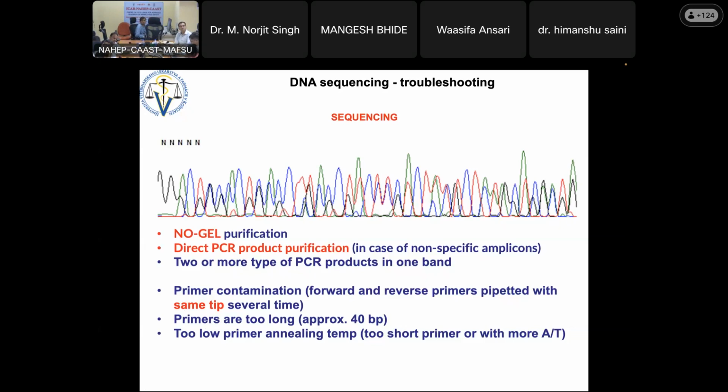Yeah, but it's up to you if you want forward or reverse. They can ask, but they ask to make money. They don't ask to help you. They ask for money only because one sample means a forward sample and a reverse sample. The company has a trick to make money, saying the sample has to be sequenced by both. It's not true.